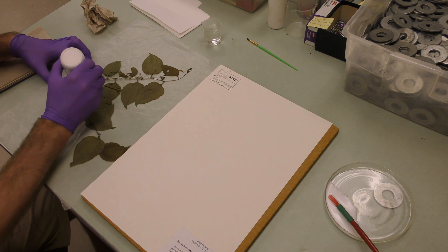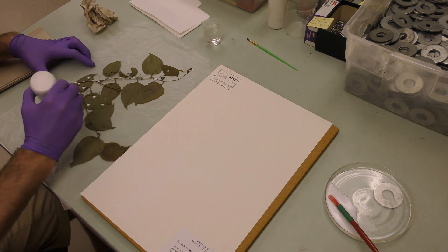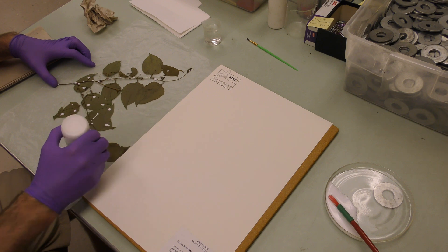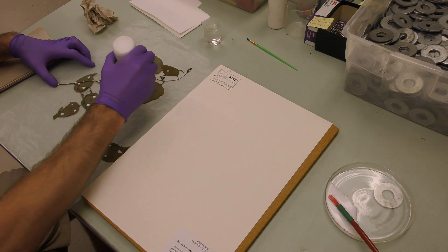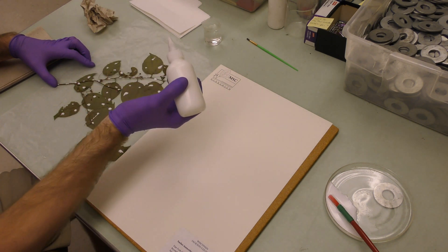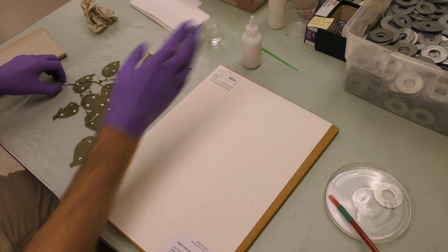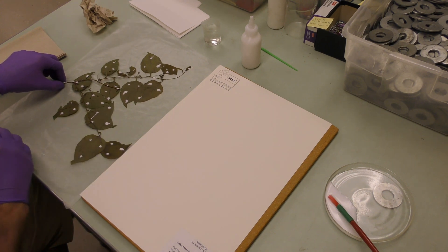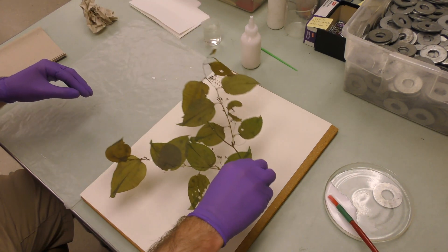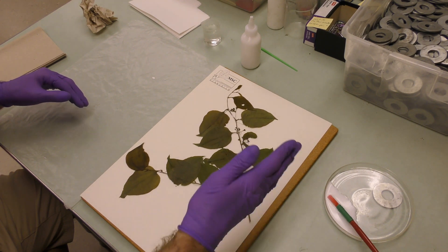A lot of it's going onto the wax paper — that's why it's nice to use wax paper. Usually with each leaf I do one, two, three dots. Make sure you get any leaves that are overlapping too. So you want to be gentle with this part. Some plants are a little more fragile than others. As you lift that up, just make sure you're not going too quickly — take your time — and then it should just go right on there.